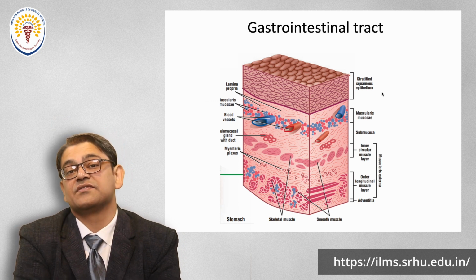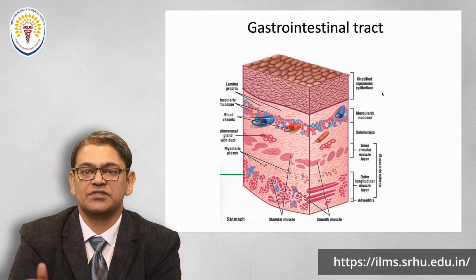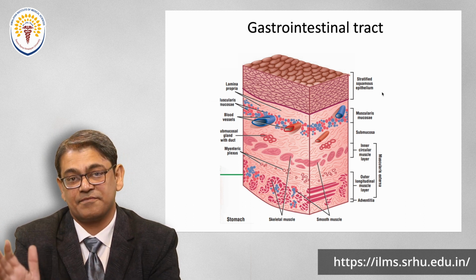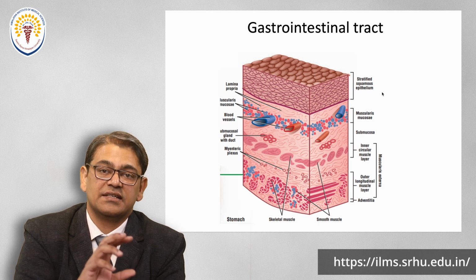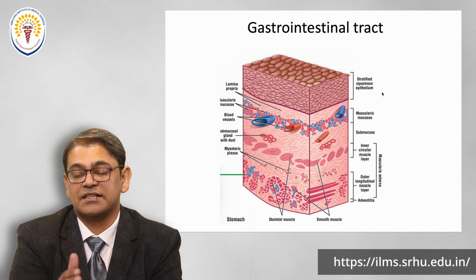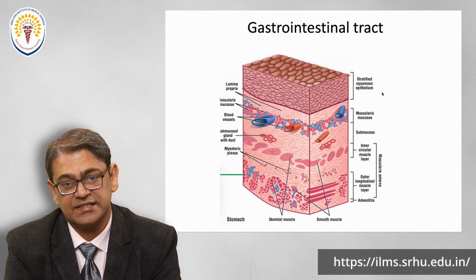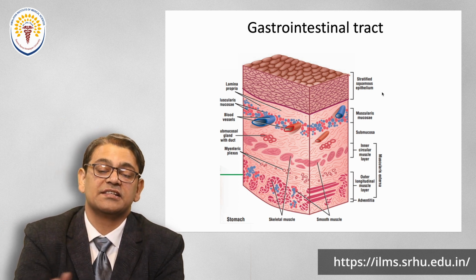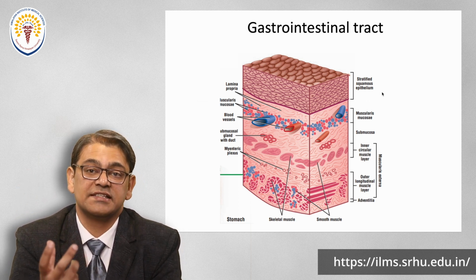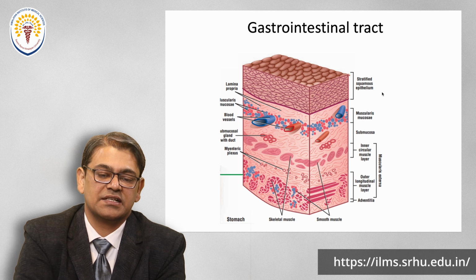This mucus cell number is very important as we go from up to down: esophagus, stomach, duodenum, jejunum, ileum, cecum, appendix and large intestine. Their number continuously increases, right? So the ratio of simple columnar cells to mucous cells keeps decreasing as we go down because of the high number of mucus cells in the lower gastrointestinal tract. In histology these cells look like peculiar inverted cup-shaped structures, and they are named goblet cells; you can clearly see it is a mucous cell.